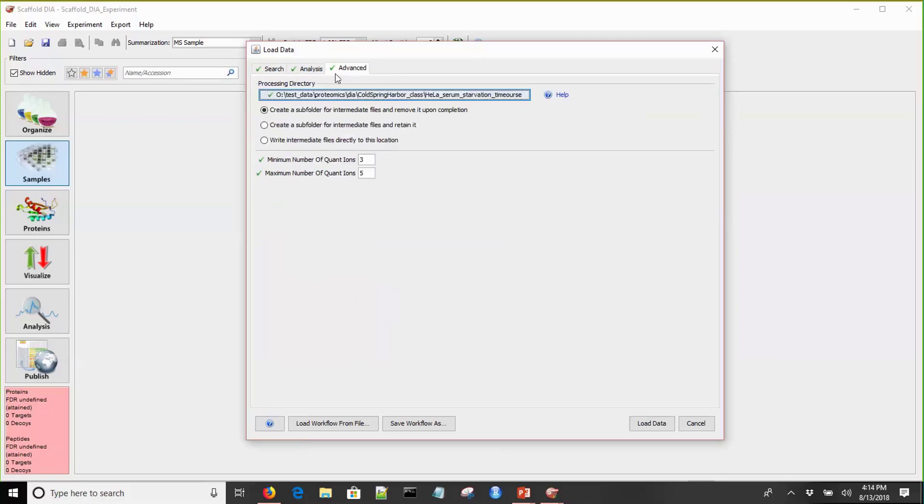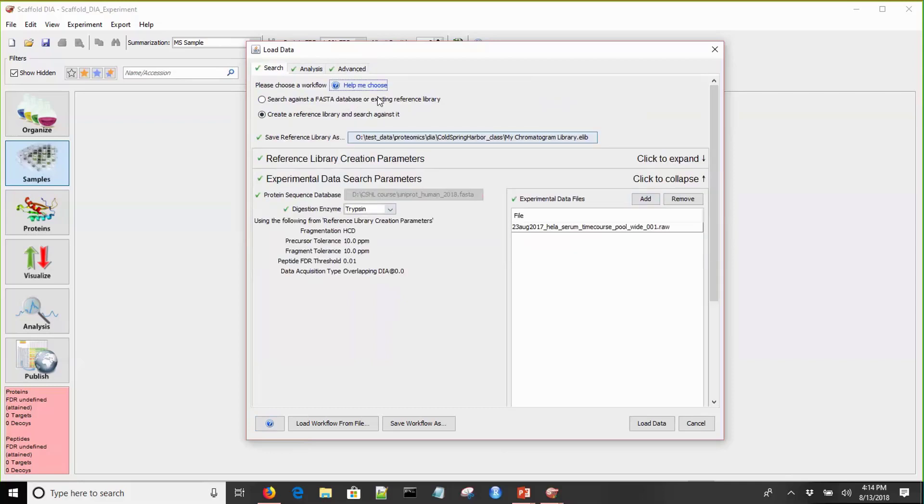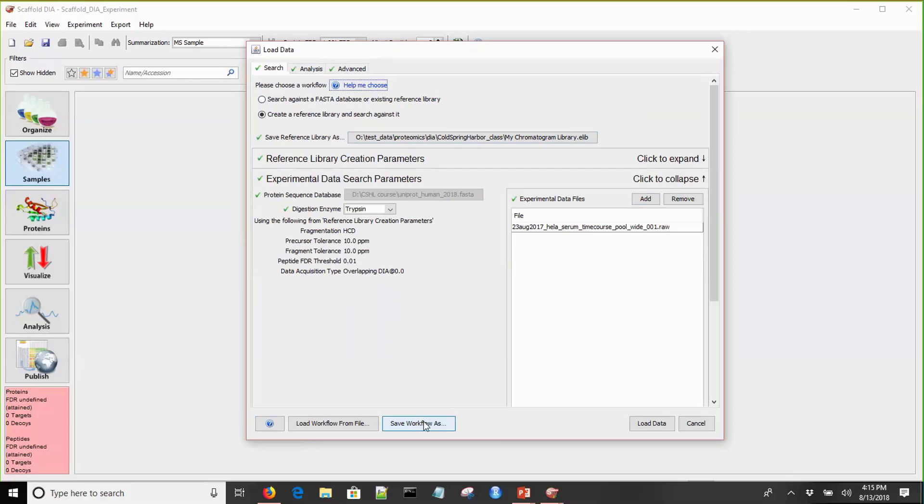On the Advanced tab, you want to point Scaffold DIA to a processing directory, and this is where we'll write intermediate files during processing. Now we see all of our triangles are cleared, we have green checks, and we could click Load Data to begin the search. The last thing I want to call to your attention are the workflow file buttons. The Save Workflow As button allows you to save your parameters into a workflow file that you can then use to load data again. To do that, click on the Load Workflow from File button.